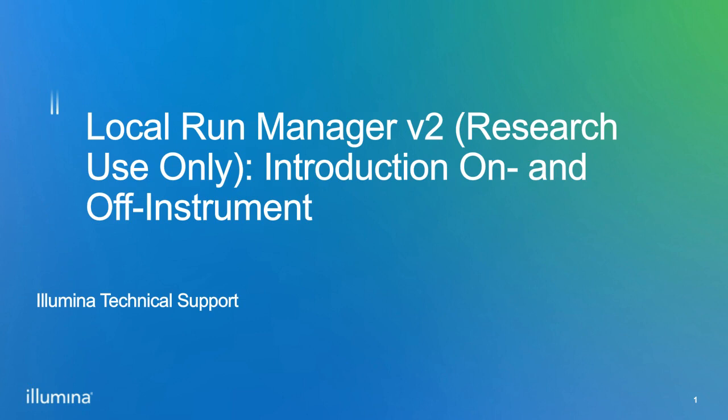As Veriska mentioned, my name is Vinh Pham from the Software Technical Applications team, and today we are going to cover Local Run Manager version 2, research use only. This is an introduction to Local Run Manager on and off instrument.